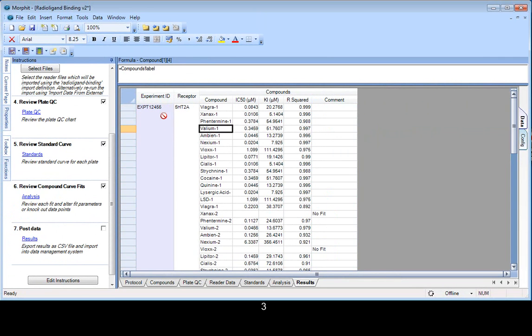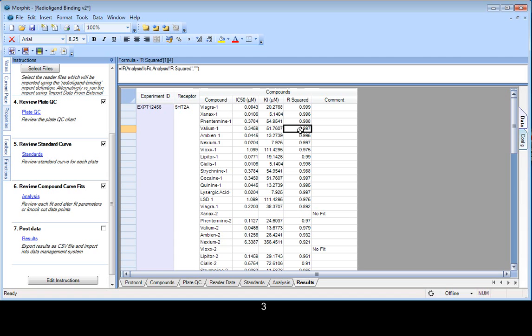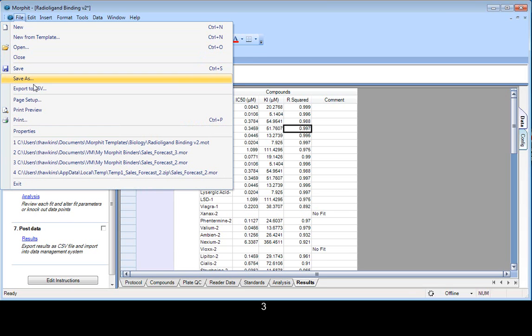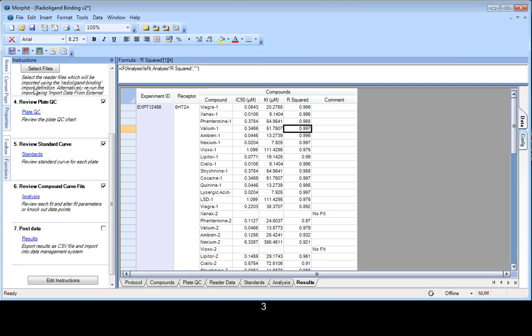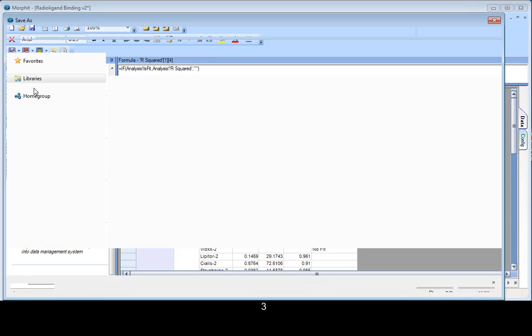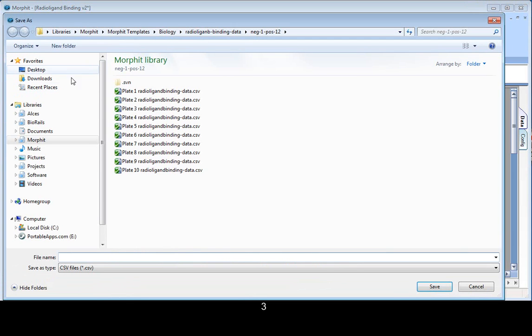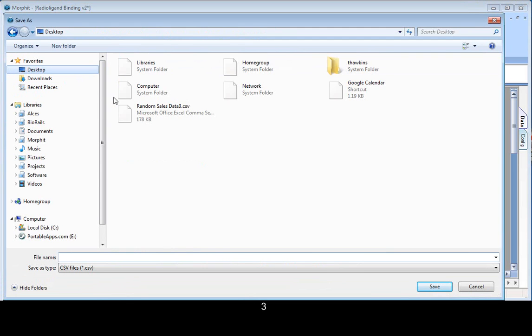Now, this has got a nice, simple structure to it. You see, for each experiment, there's a whole collection of compounds with a set of properties. But usually, what we need to do is extract this and export this into something much flatter. So we can do that in a simple click as Export to CSV. Pop this on the desktop.